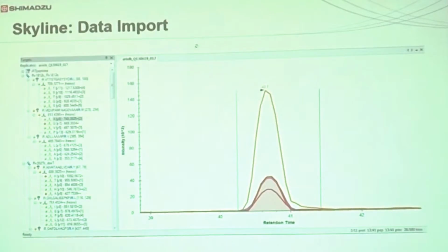For a given peptide, if all the transitions which are generated by Skyline show positive results, then that peptide will appear in green color. Suppose any of the transitions has not generated any response but the remaining others are generating response, then that peptide will appear yellow in color. If none of the transitions has generated a response, then that peptide will give a red signal.